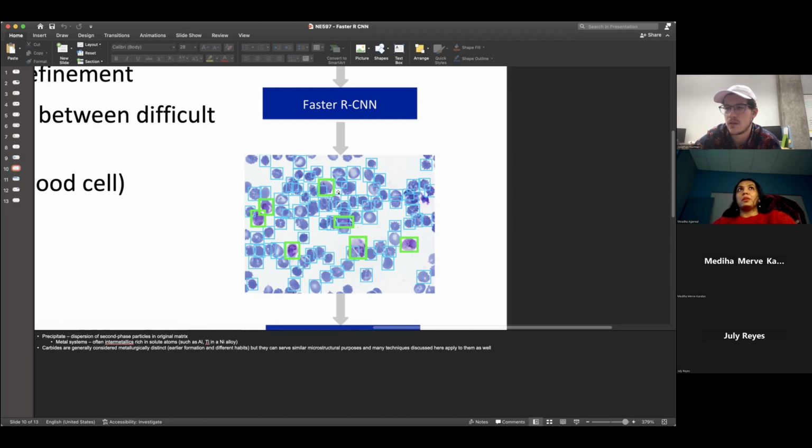So it's just something that doesn't improve. It's just the initial step, where you're breaking your image into multiple small parts, and that's getting trained, right? And it's not improving the initial image. Exactly. Because at the end of all this, you always have that bounding box regression step where the bounding box is improved to better isolate the feature. In selective search, that bounding box regression never actually reaches the selective search algorithm. So these iterations don't actually improve it. That's why it's computationally heavy, I believe.